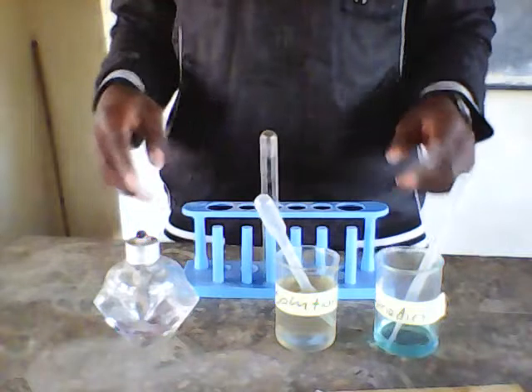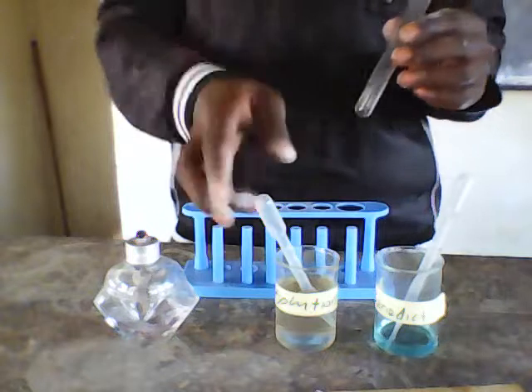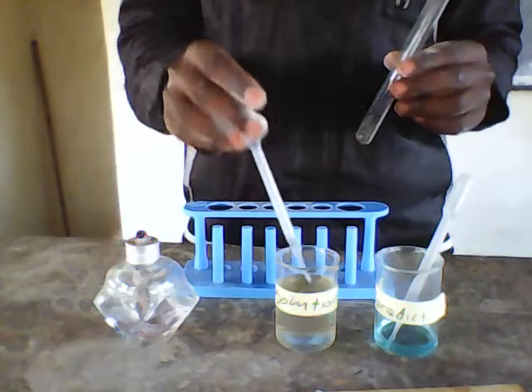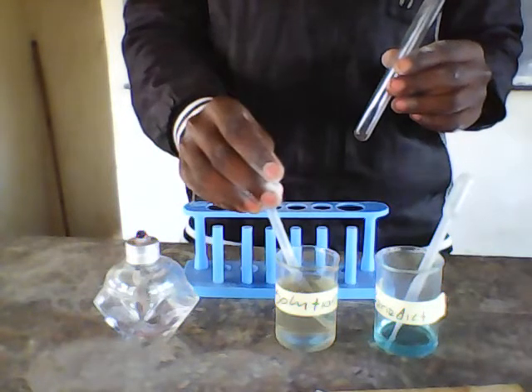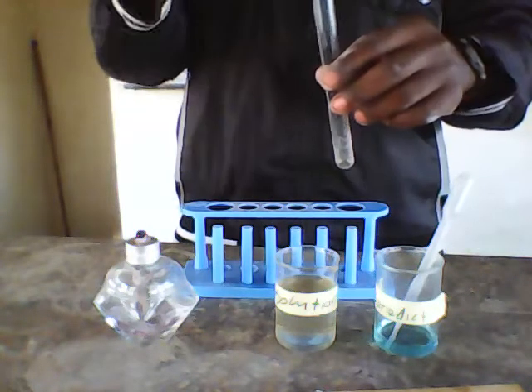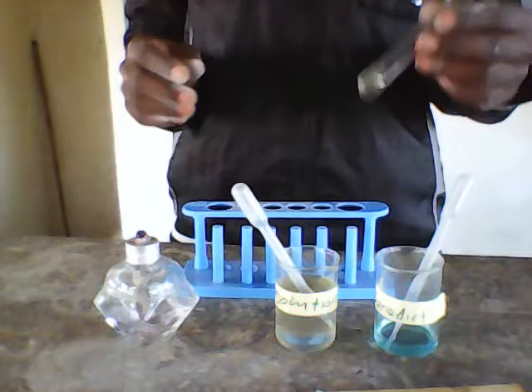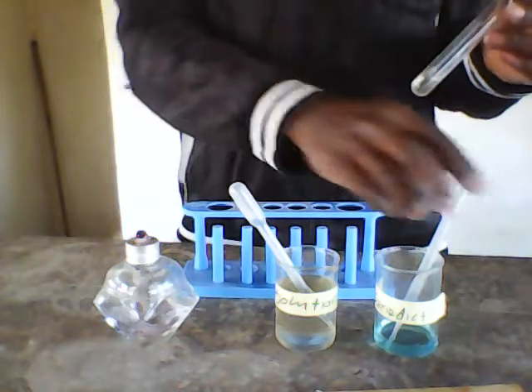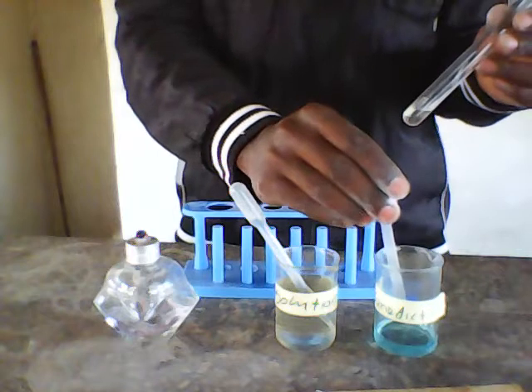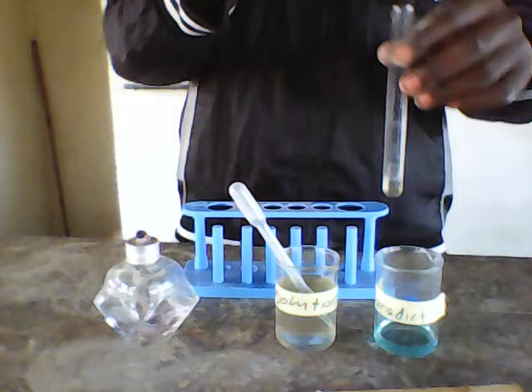So I'll start my experiment. I'll get my test tube. I'm going to add two cubic centimeters of solution X into the test tube. After I've placed two cubic centimeters of solution X into the test tube, I'm going to add two cubic centimeters of the Benedict's solution into the test tube.